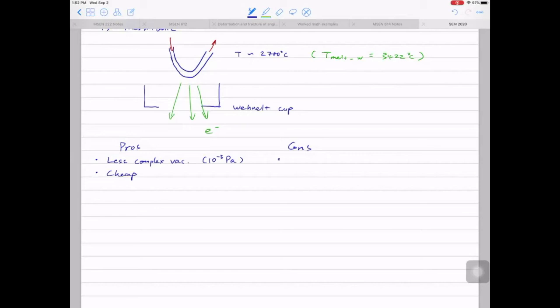The first is it has poor coherency, and this directly leads to poor resolution. That's one major drawback. We'll discuss that in detail towards the end of the class today, what it means by coherency and why it's important for the resolution of the instrument.